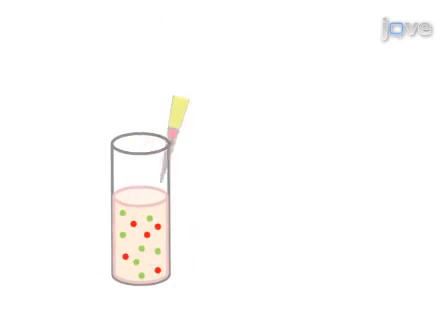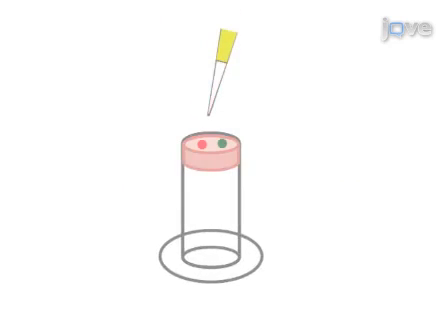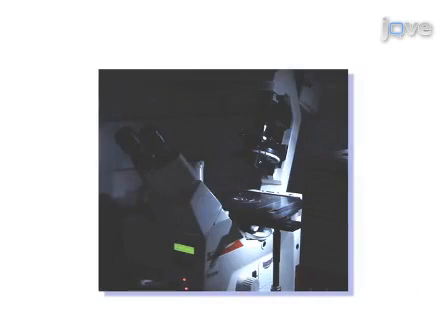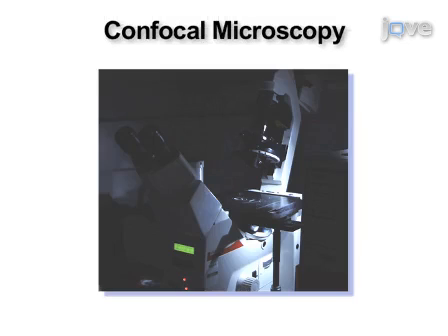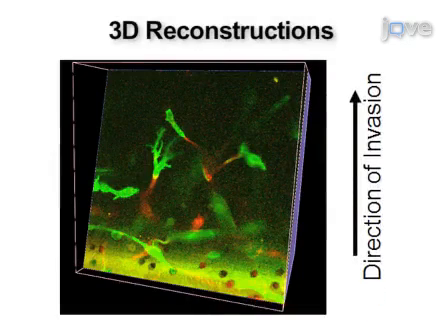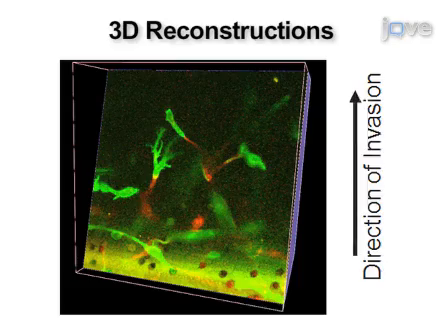Using the matrigel transwell system, measure the transmigration response to the chemoattractant with test drugs or treatments. Proceed to visualize and analyze cell invasion by confocal microscopy. Ultimately, results can determine the magnitude and mode of cell invasion into three-dimensional protein matrix.